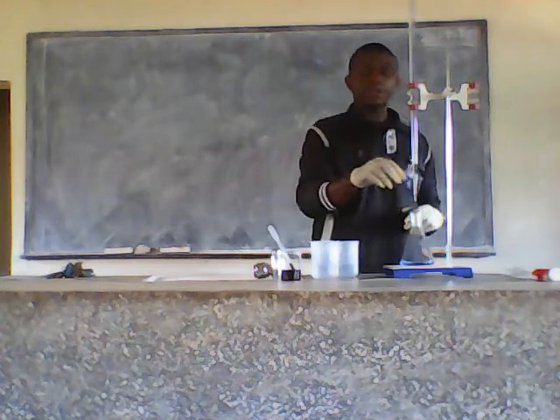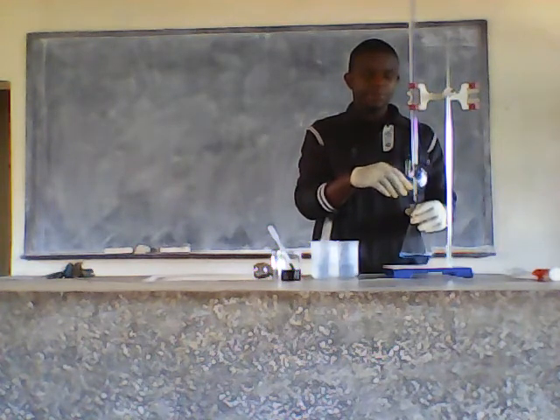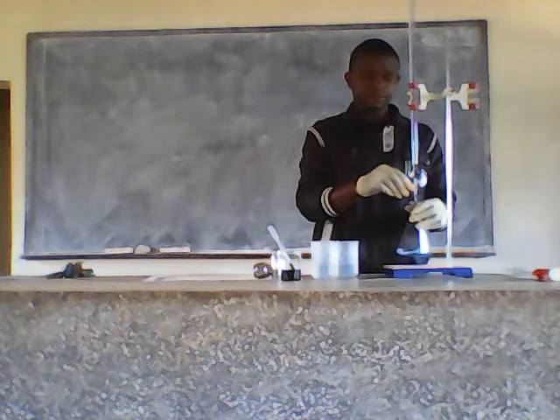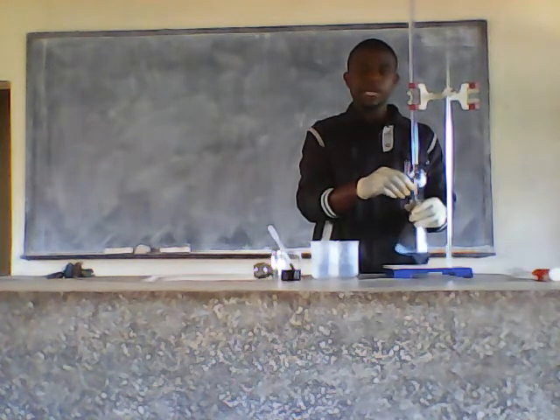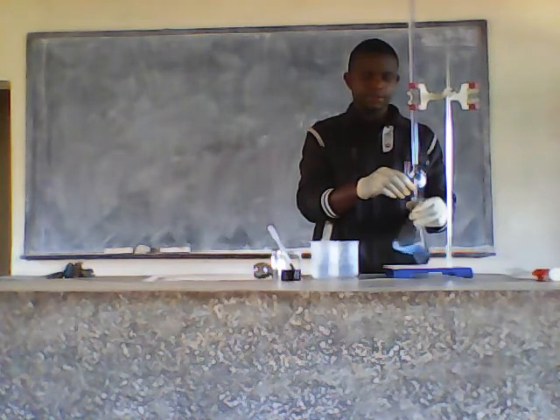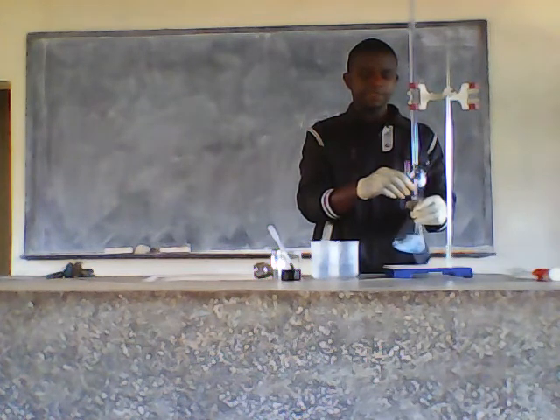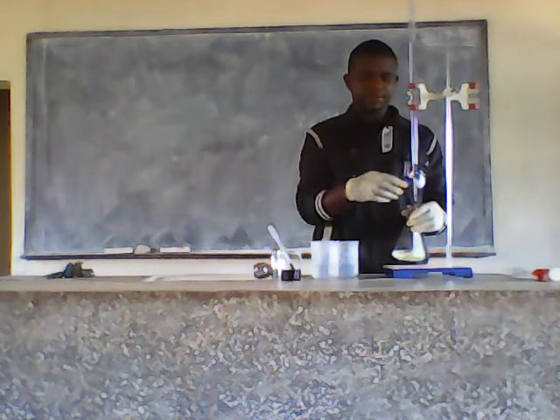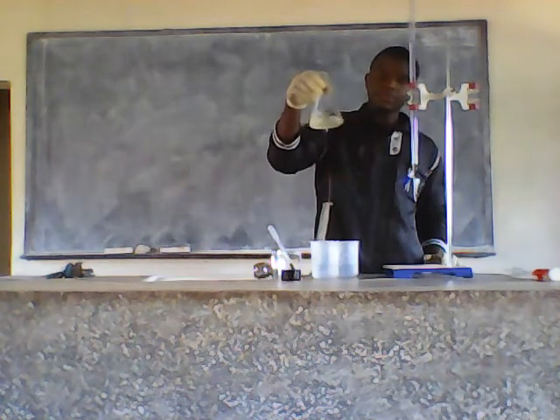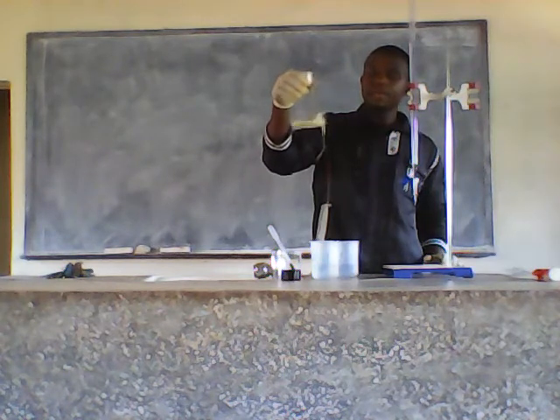In this case, I'll use my right hand to open the tap, then I'll use my left hand to shake the conical flask. Make sure you just open the tap slowly, then start. Immediately, I'll see the first colour change. When the first colour change appears, this means that all the acid added to the base has reacted completely. So I have my colour here, and the solution has turned yellow. The yellow colour indicates the end point.